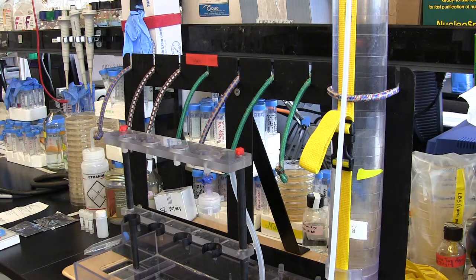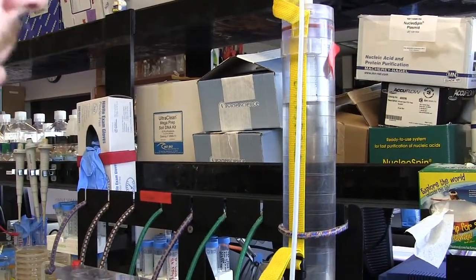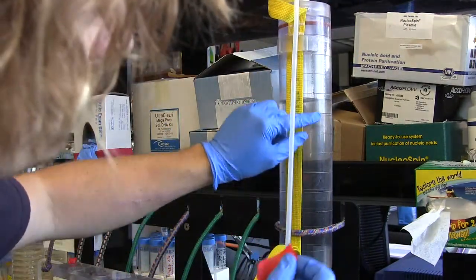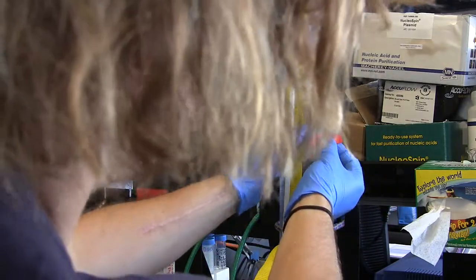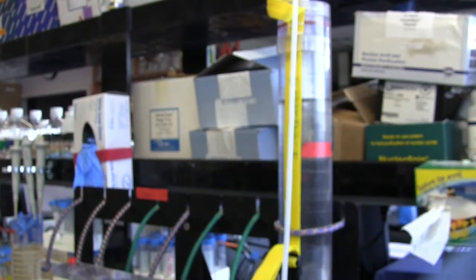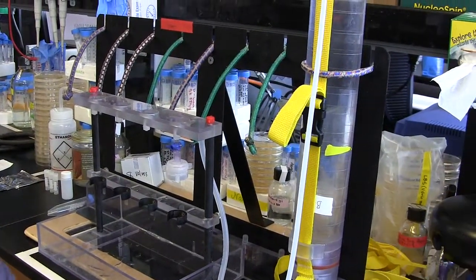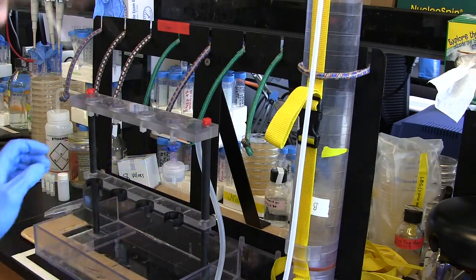The first thing I want to do is pass a couple hundred mils of water through the system. To mark that, I'm going to take a piece of lab tape — the Niskins have scratches that mark 100 mils — and put it down at 200 mils, rounding up a little because I want to flush the system as well as I can. Also notice that I have my filter holder on here with no filters — I just want to rinse out the inside.